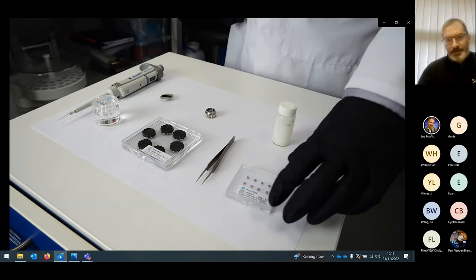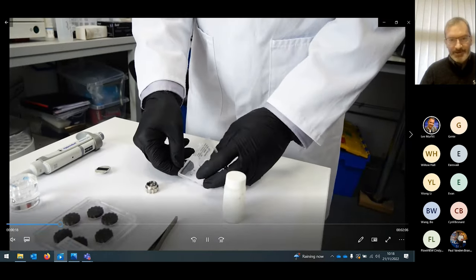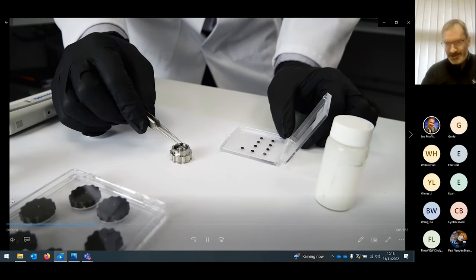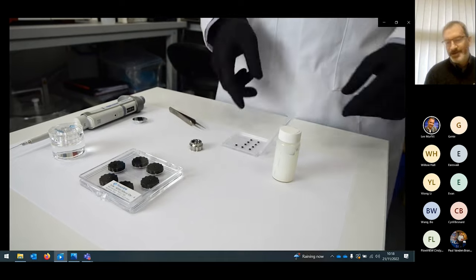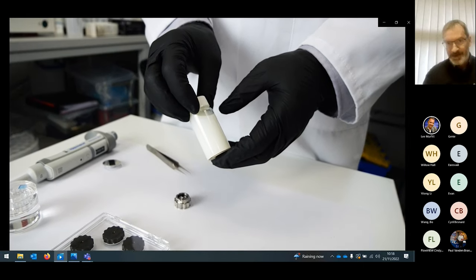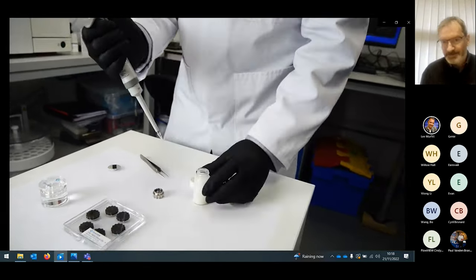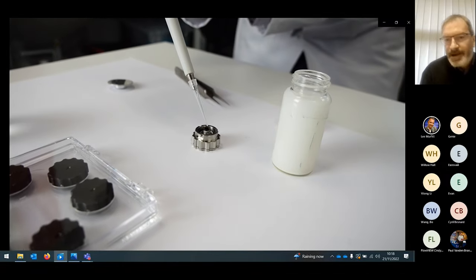The first step is to take one of the substrate spacers and place it on the sample holder of the Aquarius using a pair of tweezers. As with all SEM analysis, you want to work in a fairly clean environment. It's stuck on just a little bit with a tiny bit of glue, so it sometimes needs a little wriggling off. The purpose of the spacer is to control the thickness of your liquid sample — it comes in two different sizes, and for bigger samples you can also use it without. The sample I'm going to demonstrate is a cerium oxide suspension.